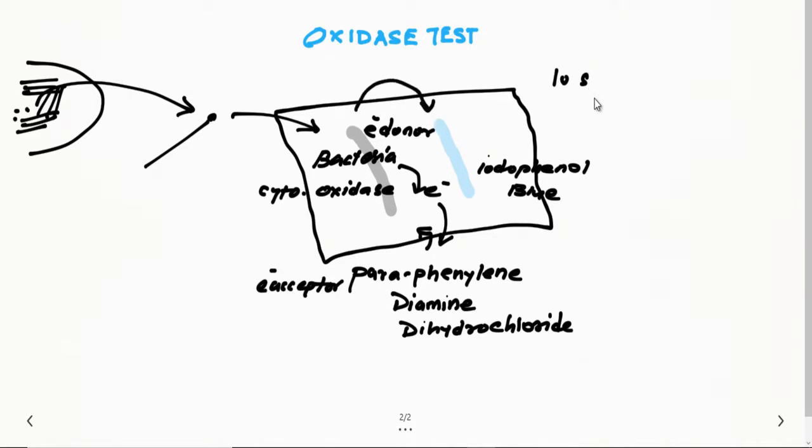Within 10 seconds, you will observe the color change from colorless to blue, and that is your oxidase test positive. If it remains colorless, that means it is a negative test. If it becomes blue in color, it is positive oxidase test.